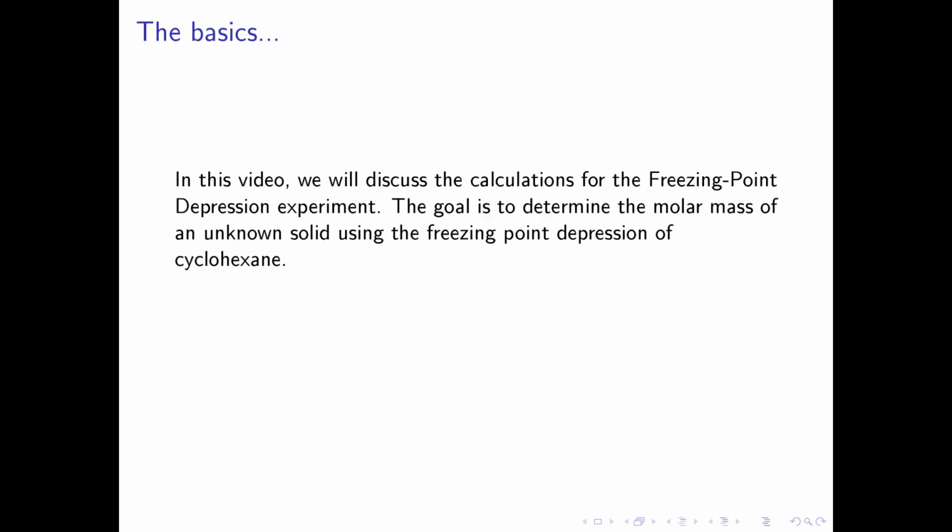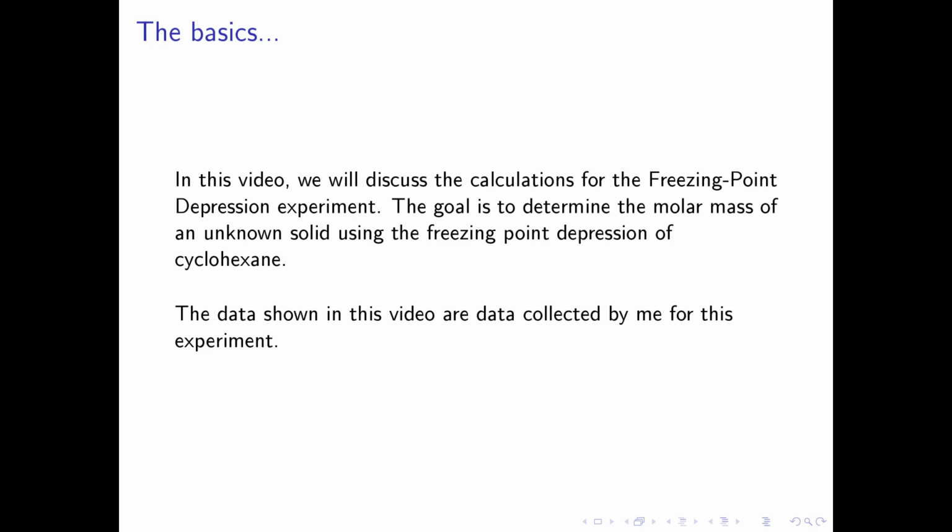In this video, we will discuss the calculations for the freezing point depression experiment. The goal is to determine the molar mass of an unknown solid using the freezing point depression of cyclohexane. The data shown in this video are data collected by me for this experiment.